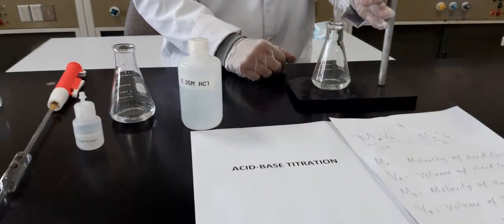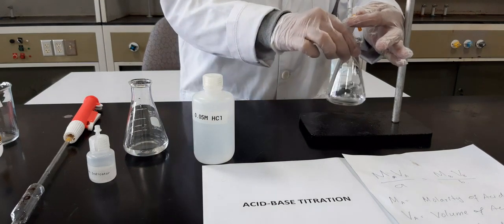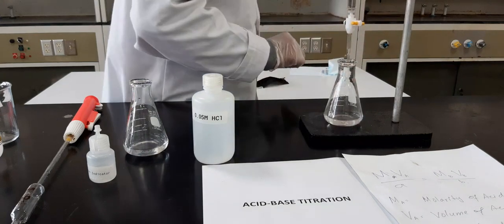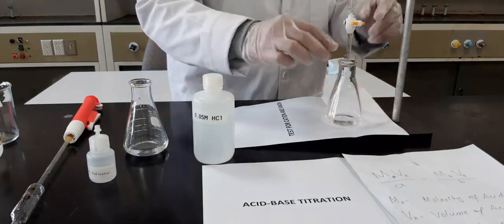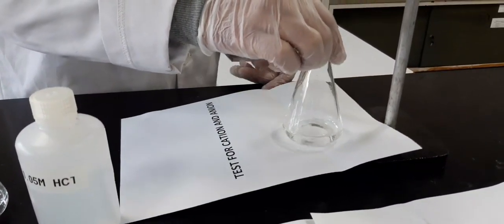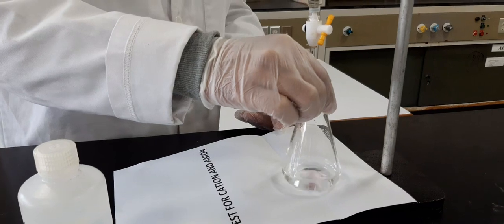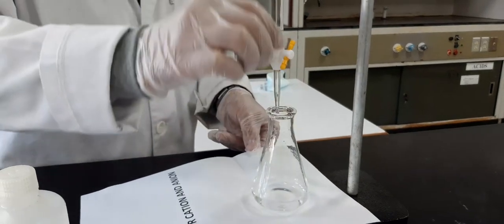Look at this. We'll add dropwise slowly, and then I will swirl it or shake it. You can see a little bit of color change. If the background is white, you can see it clearly. We started from 0, make sure that the initial volume is 0. You can see a pink color, but when I shake it, the pink color disappears. It means the reaction is not completed yet. It will take more drops of base from the burette to the acid.